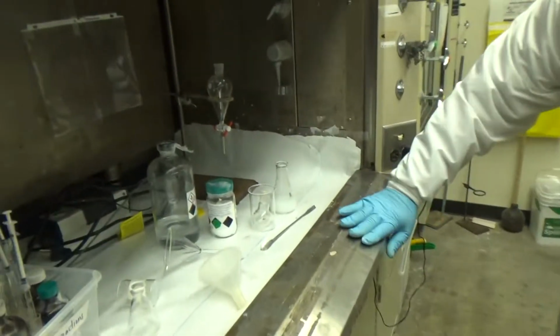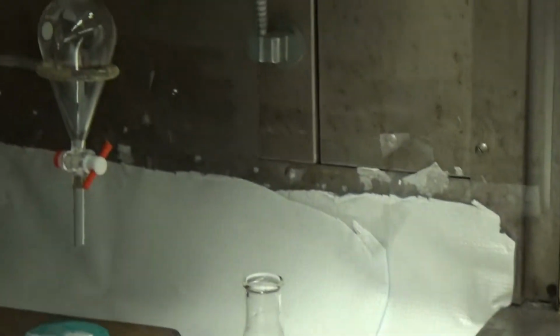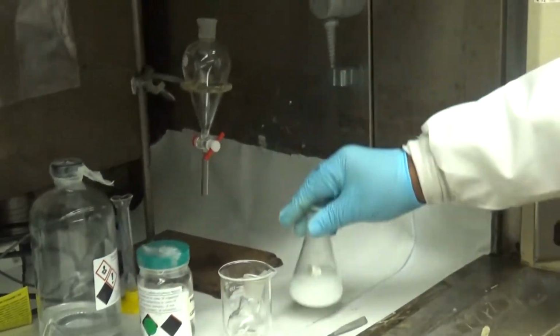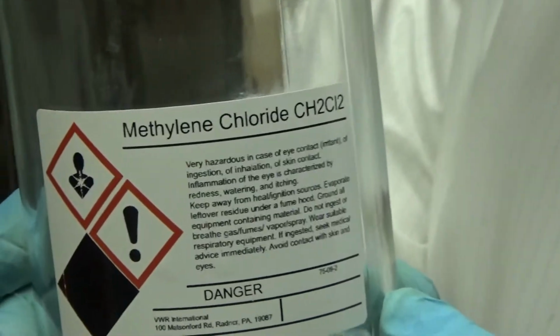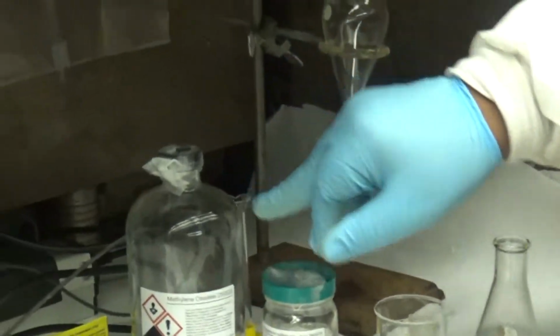I need to give some explanation. So the solvent you are going to use to extract the eugenol from this solution here will be methylene chloride, which is CH2Cl2. It's also called dichloromethane. But you need to do that in the hood.